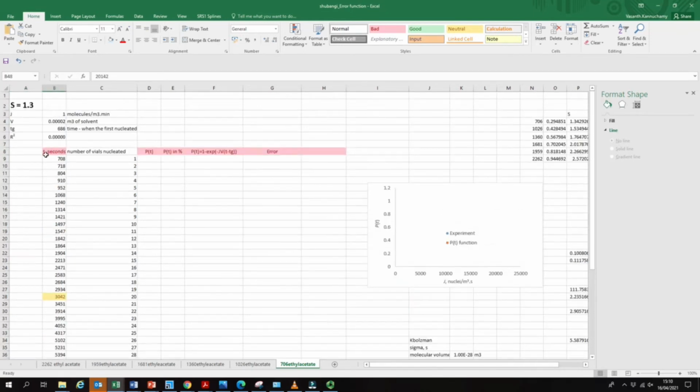So we have to wait. That's why we cannot sit in front of the water bath. That's why we are installing the camera. Normally once we transfer the vial, which we saw in the video, from the first water bath to the second water bath, which is at 15 degrees centigrade, we switch on the agitation, and then normally we go home. This is more or less an overnight experiment.